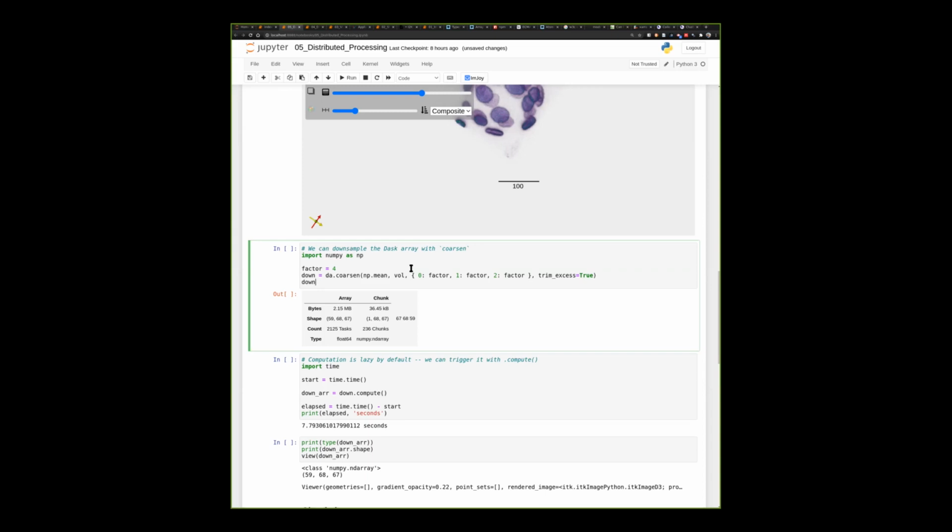You can have common image processing schemes like run a Python function on an expanded version of a chunk and then throw out the overlapping regions and use the trimmed result. So you can think of convolution, if you wanted to do convolution operations and get the same result on a chunked distributed computation as non-distributed computation. That's a way to do that.